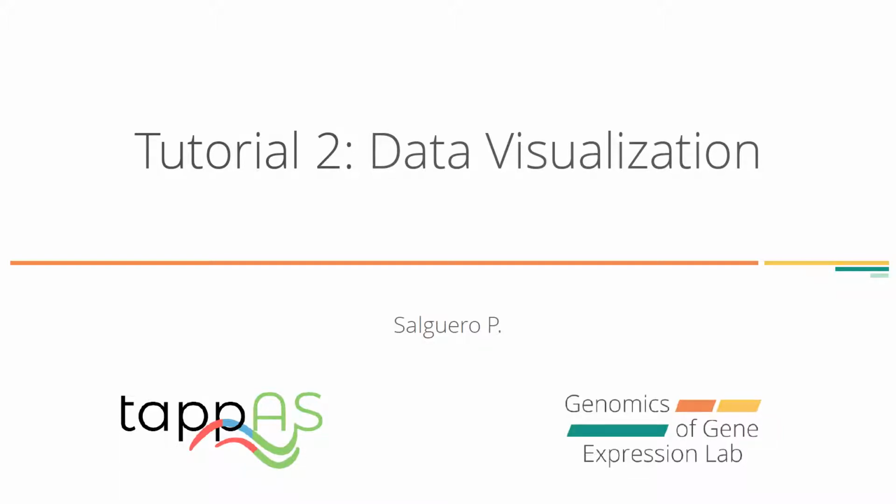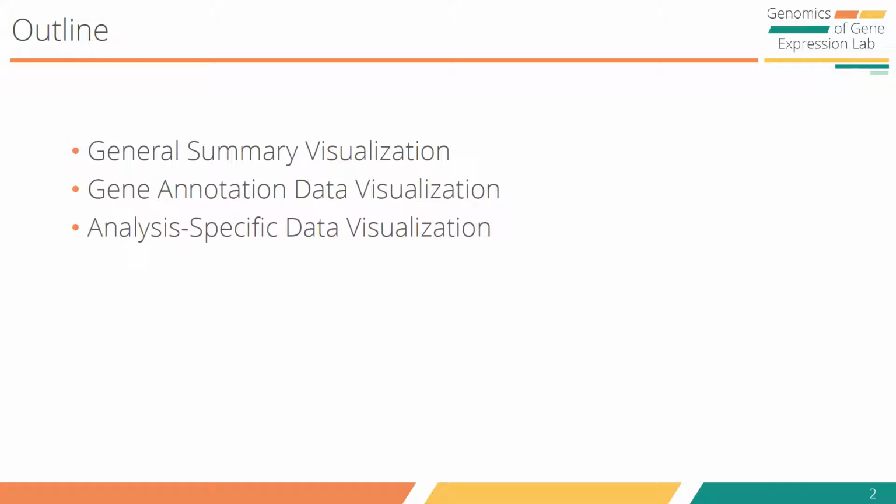Video Tutorial 2, Data Visualization. In this video we're going to talk about one of the most important features of tappAS, its visualization. It includes general summary visualization, gene annotation data visualization such as transcript or protein structure, and analysis-specific data visualization.